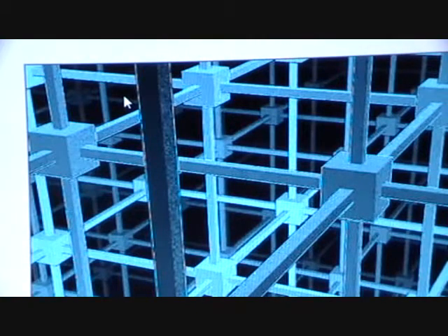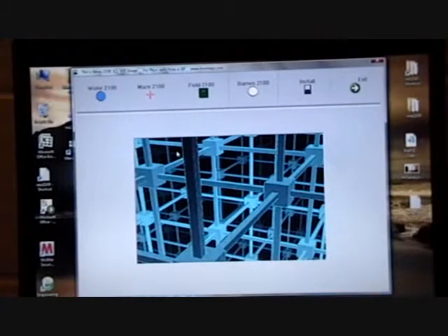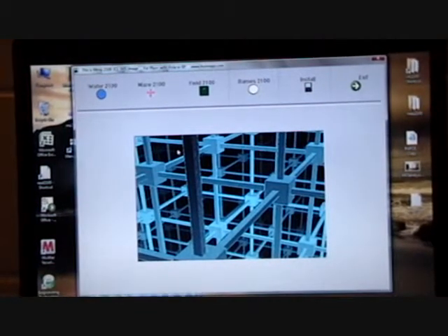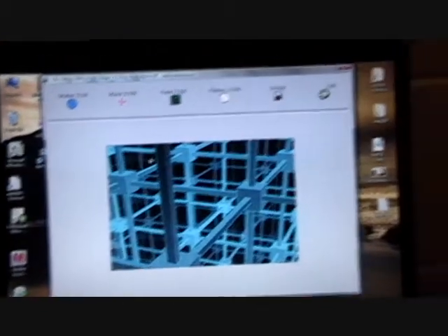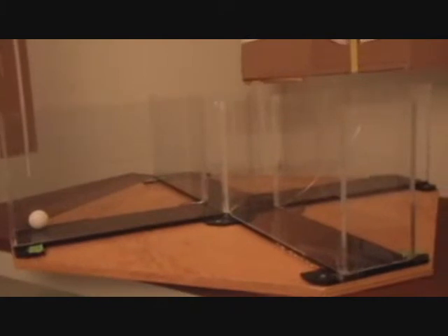And as I said, we have our water maze and our plus maze set up in the same room, so we can just put a table over it. And let me just go back over there. We just put a table over our water maze. So in fact, we have water in the maze right now, it's in use, but when it's not in use, we can put a plus maze on top and then track animal movements there.